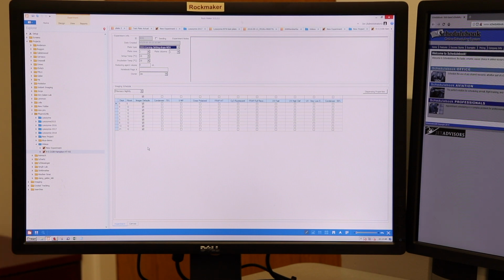And you'll still see it at day 0. The nightly, it typically will image about 12 hours after the setup. That way it's doing most of the scheduled imaging at night when no one's using the system.